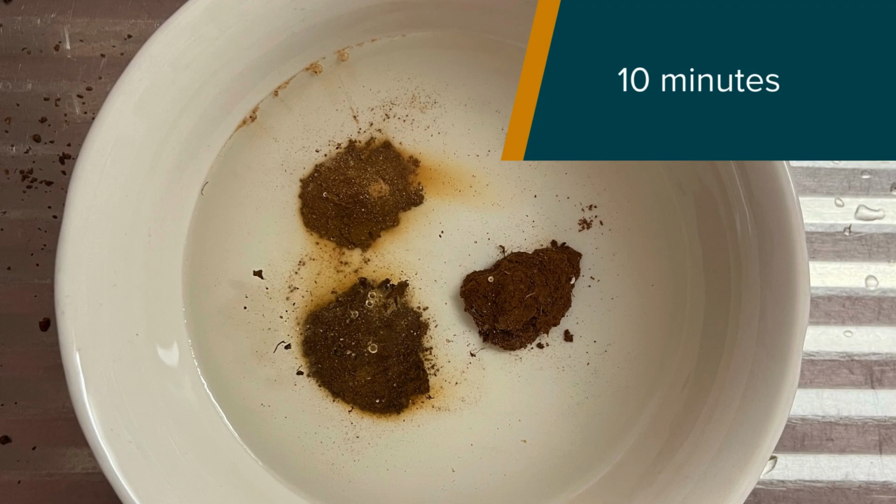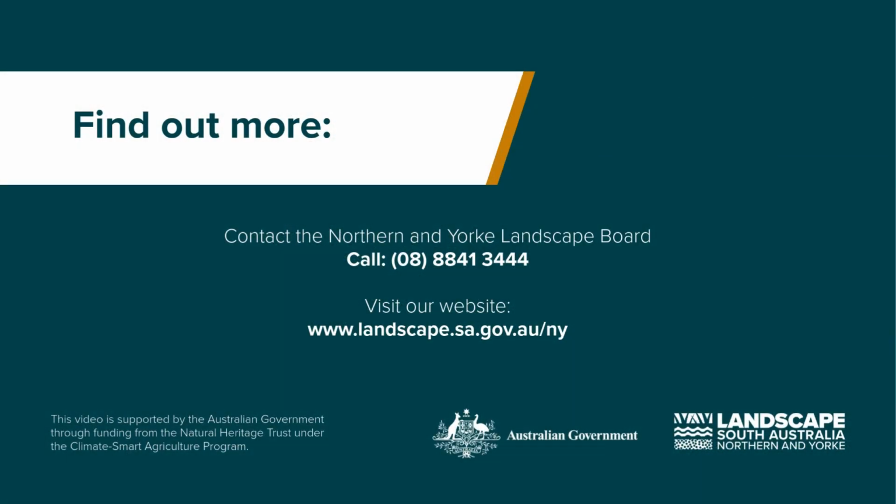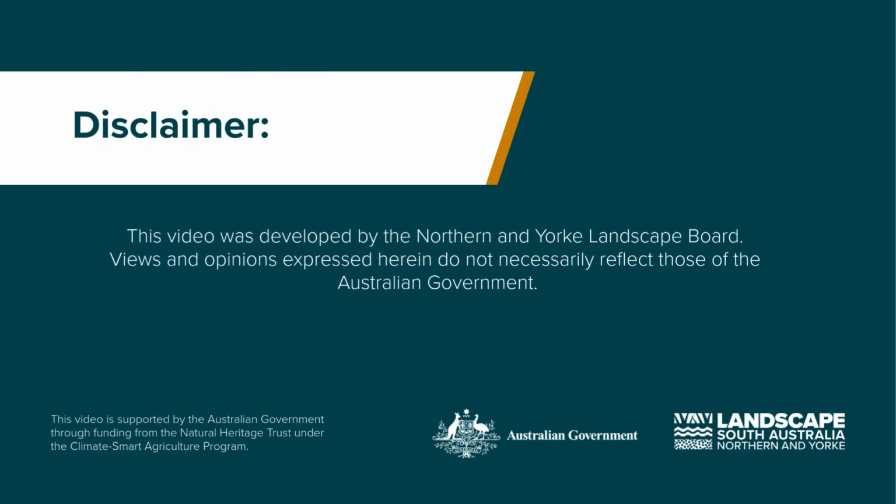After both 10 minutes and 20 minutes, the samples are looking very similar. Those two new samples that I added are showing partial to complete slaking, and they're also showing slight dispersion is present. There you go. That's how easy it is to test for slaking and dispersion.